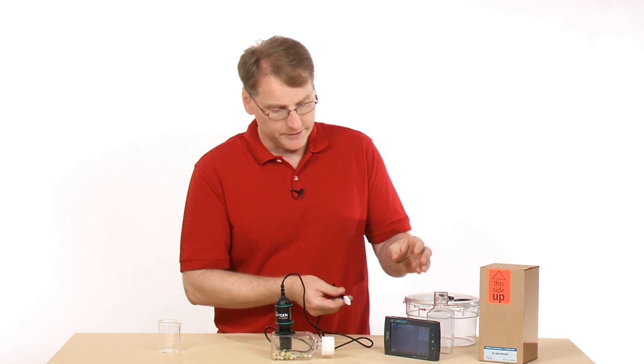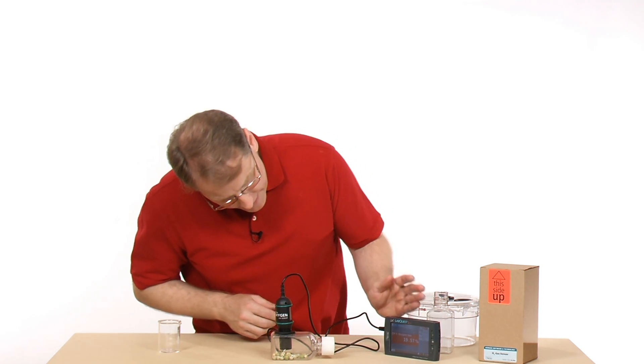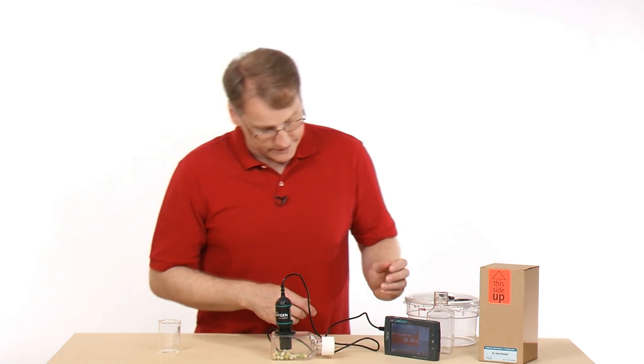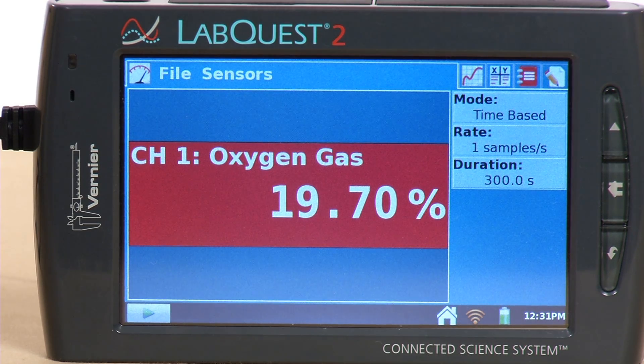And then plug in the sensor. And so when I do this, it's plugged into channel 1 there. So it's giving me the oxygen right now in terms of percent.